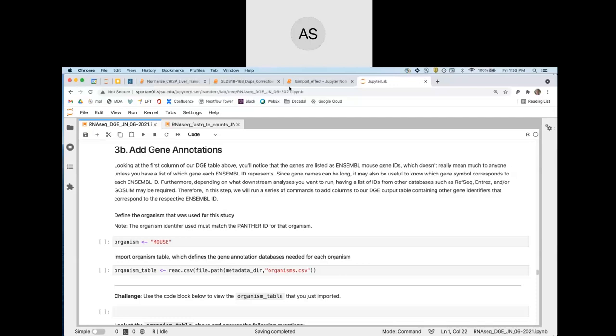And what they do is a calculation where, if they were to take just one set of reads from those that they identify as duplicates and remove all the others, that's what they're saying is their deduplication amount. In doing that, though, they don't have UMIs, right? So they're not accounting for true biological duplicates.